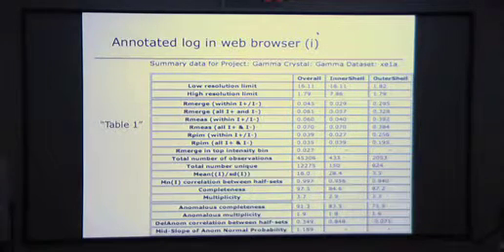Okay. This is kind of the table 1 that you get out of, I think this is probably from Aimless rather than Scala. But basically, what you want to look at is to know what the numbers should be like for good data sets. And you can discuss with other people in the lab. I don't want to talk too much about that, except that overall, you'd expect the values to be a bit higher than for the inner shell. The values for the inner shell data should be very good, and in the outer shell, they should be verging on the marginal and getting sort of reasonably bad values.